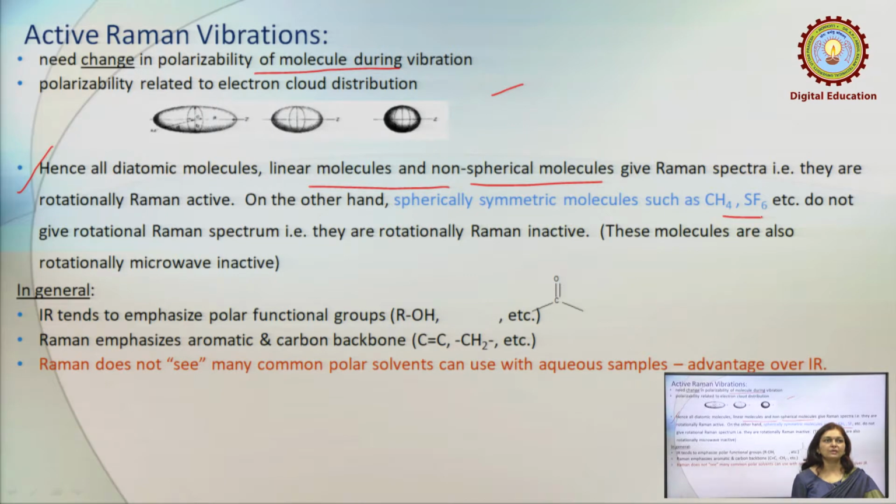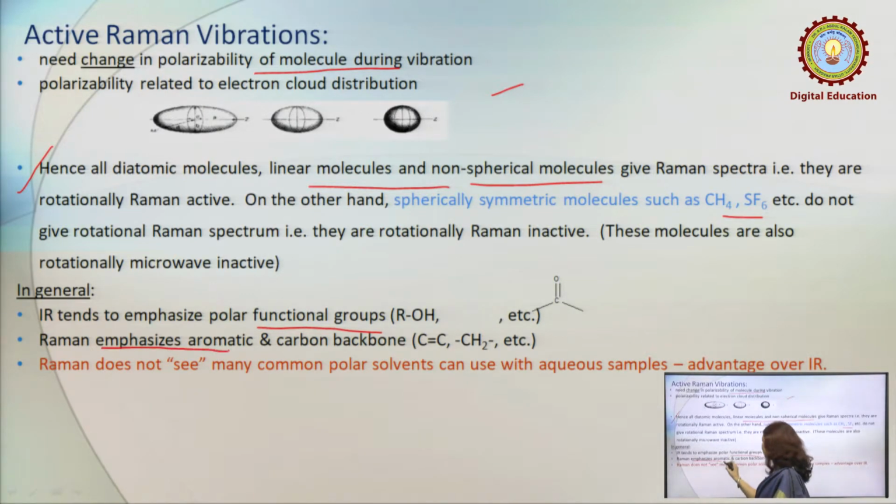These molecules are also rotationally microwave inactive. In general, IR tends to emphasize polar functional groups, while Raman emphasizes aromatic and carbon backbone.